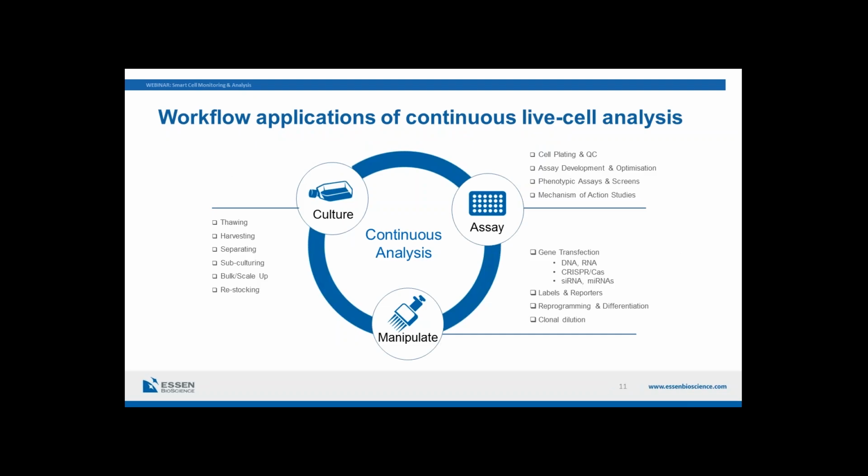Okay, so just thinking about that kind of continuum of cell culture, cell manipulation, and phenotypic assay, I've tried to list on this slide a few of the workflow applications where continuous live cell analysis adds value. I won't go through them one by one, but they're clustered as cell culture activities, cell manipulation activities, for example, stem cell reprogramming or clonal dilution, and cell assay activities, starting from quality control and cell plating through to detailed mechanism of action studies.